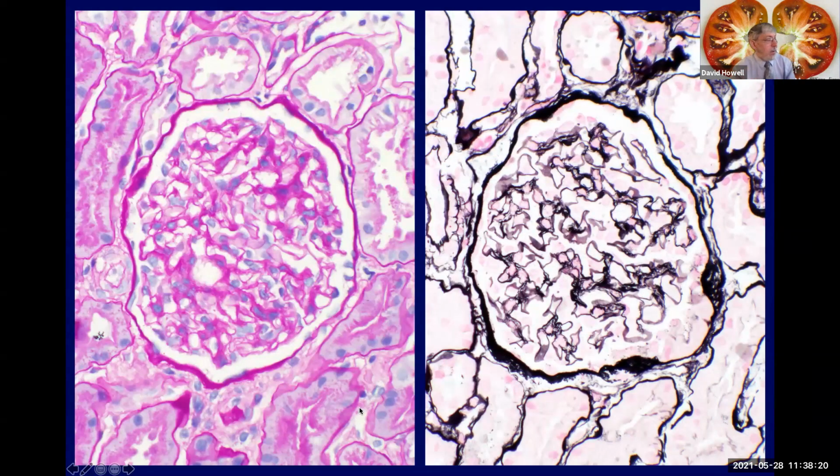And here are a couple of our other histochemical stains. This is a PAS stain, or periodic acid Schiff stain, which is a carbohydrate stain. There's a lot of carbohydrates in renal tissue and things like glycoproteins. If there are immune complex deposits here, the heavy chains of antibody molecules are also glycosylated, and they'll show up as PAS positive. So these mesangial areas look a little bit expanded, and here's one that's got about 5 nuclei. So again, it looks like something's going on in the mesangium.